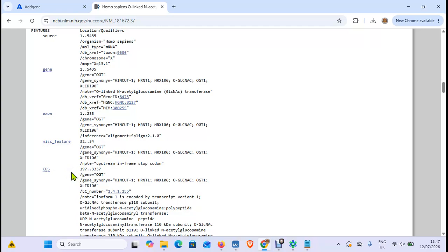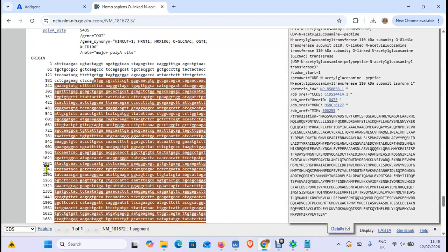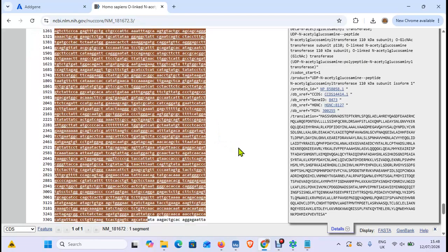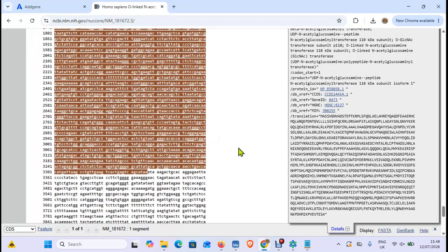But an extra little bit of laziness: if you just click on the CDS, which is a hyperlink, boop, you suddenly find yourself with the whole coding sequence highlighted in brown. And as you can see, my mouse pointer is still set on Woodstock mode, and the first three letters are ATG, everybody's friend, the start codon, which is super. And similarly, if we pan down to the tail end of this not inconsiderable gene, TAA is what greets us at the end, the classic stop codon.